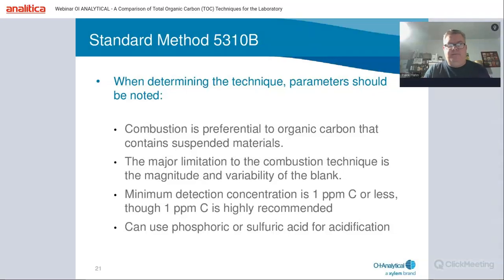A little more expansion on 5310B. This combustion method is preferential for organic carbon that could contain suspended materials. That's a better technique to break that up. In wet oxidation, you might not be able to oxidize those.